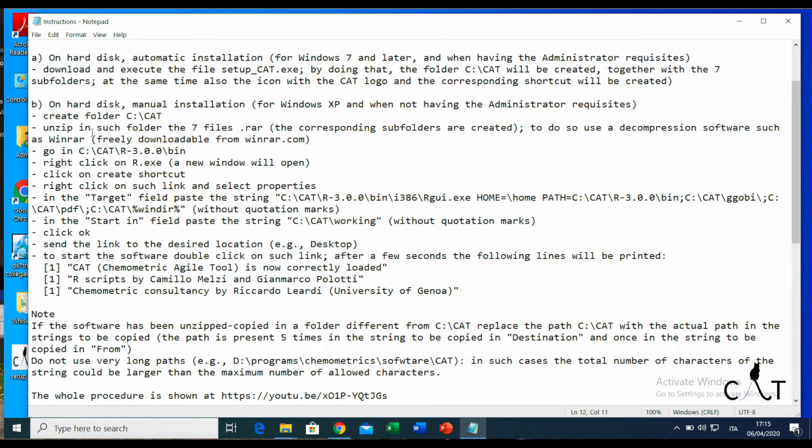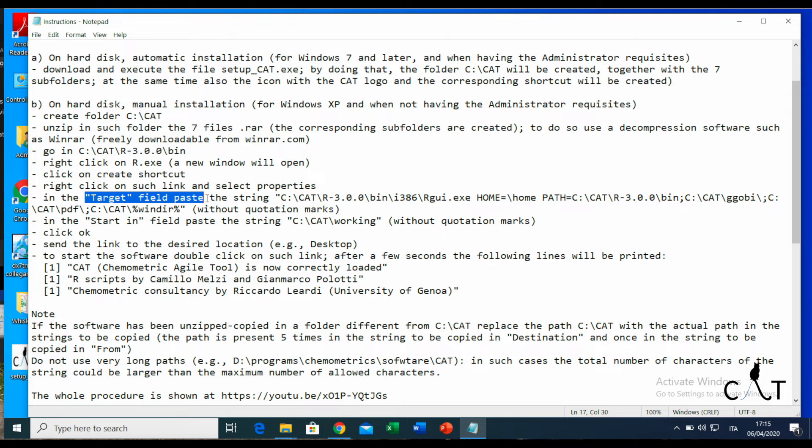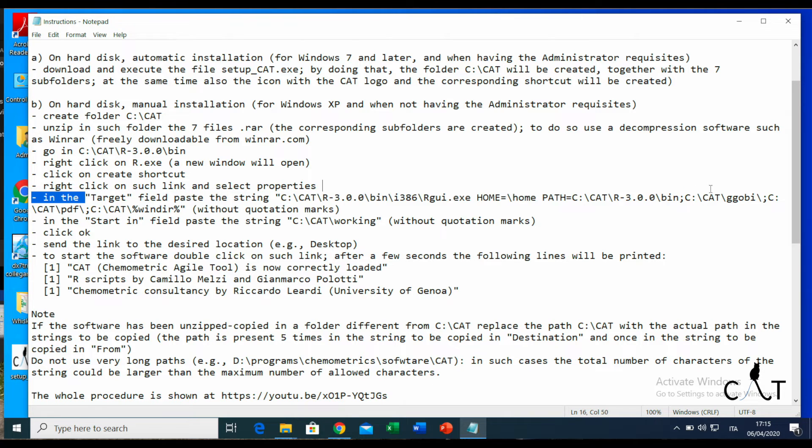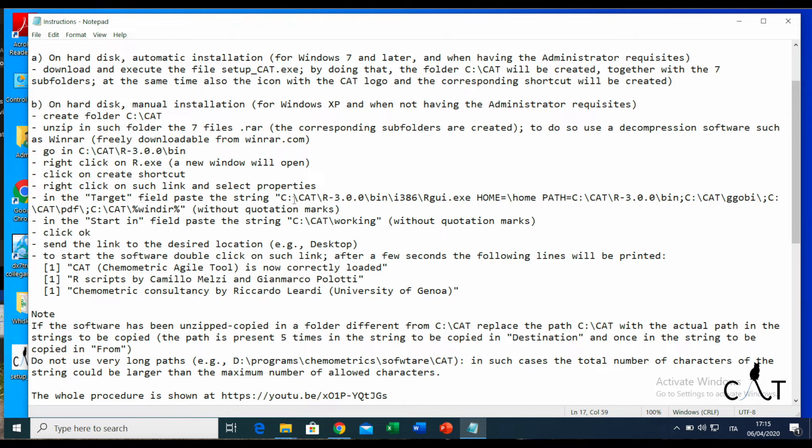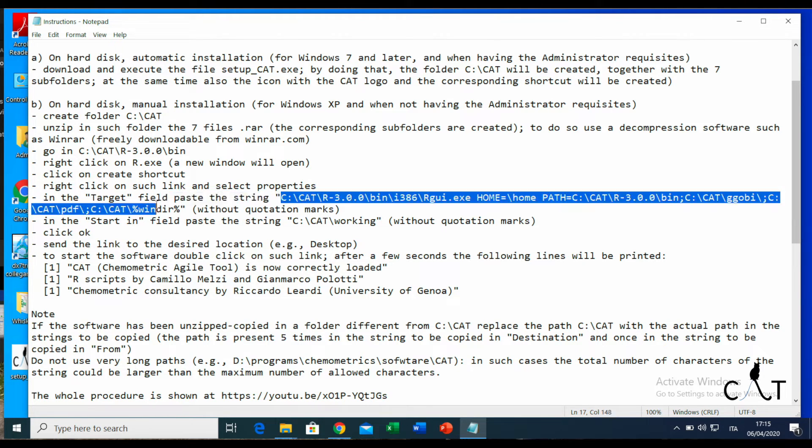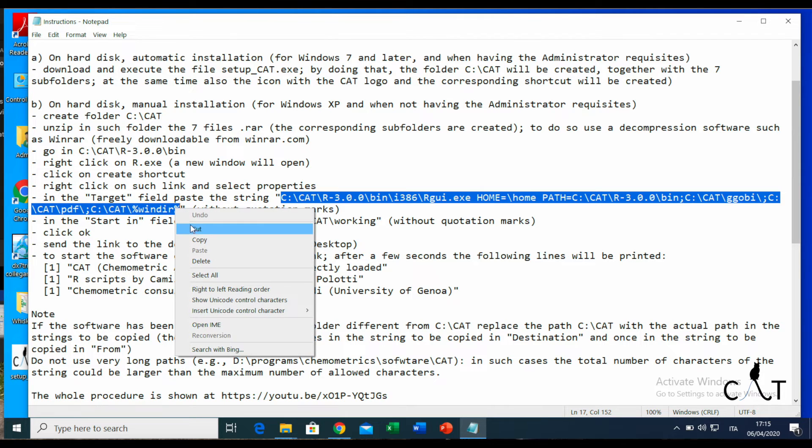Now we click on properties. Following the instructions, we need to insert the string I'm highlighting right now in the field target.